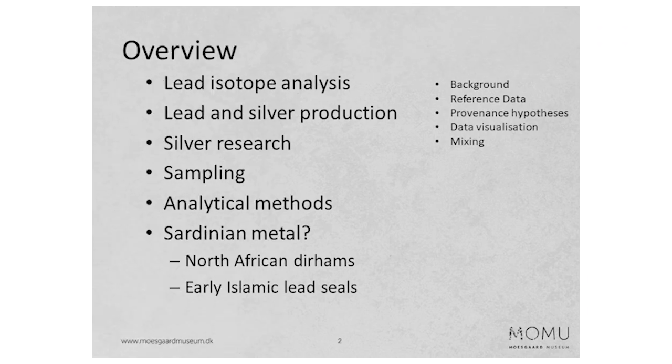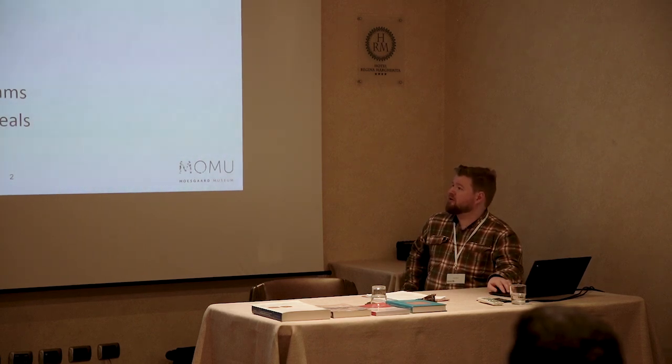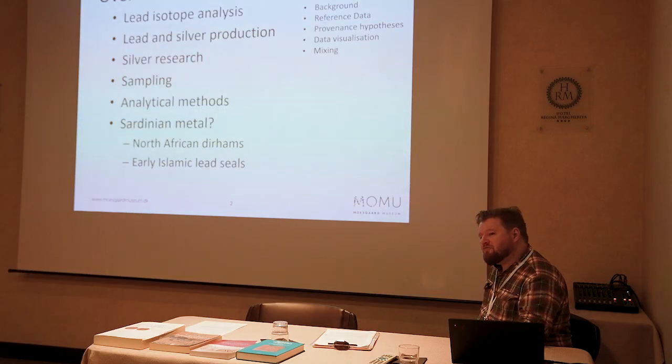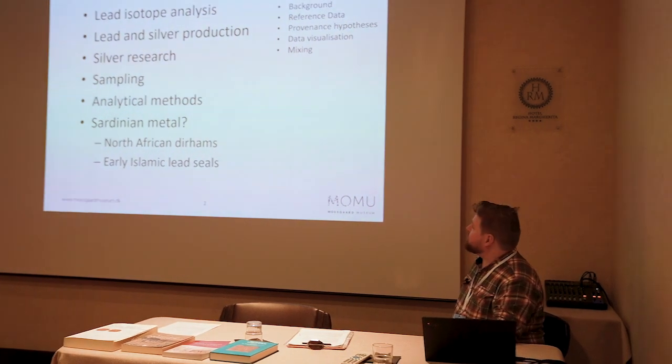What I want to do is kind of rush through background into lead isotope analyses. It's quite standard. If you know about it, I'm sorry. If you don't, I'm sorry, because it's also sometimes a little bit complicated. The main reason for this is not to tell you how the method works, but more to tell you some of the issues that we have to tackle, some of the challenges.